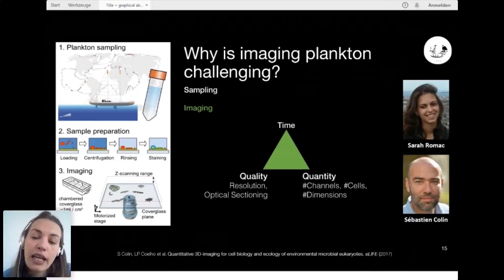And we cannot really replace this expertise in taxonomic annotation. However, the actual image acquisition can be automated, and the annotation process can be supported by automated predictions. And this also allows the annotated data to be stored and reused, and human bias can be reduced a lot.